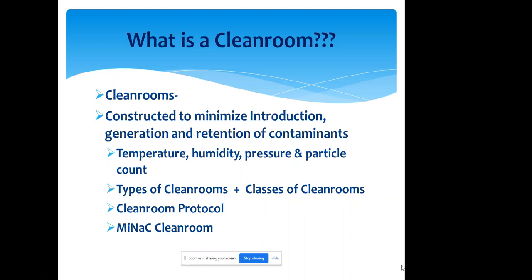So our clean room is a microelectronics clean room, and it's a class 100, class 1000 in the old terminology, or class 5 and 6 in the new terminology. And we monitor the temperature, humidity, pressure, and particle count in our clean room.